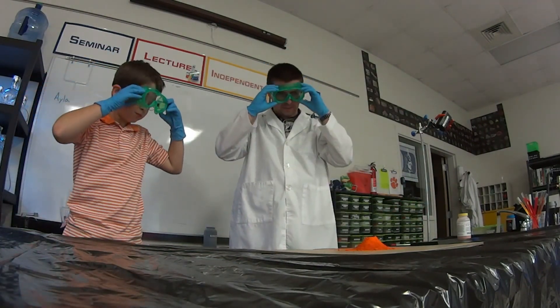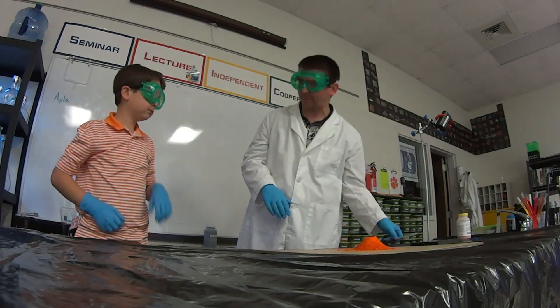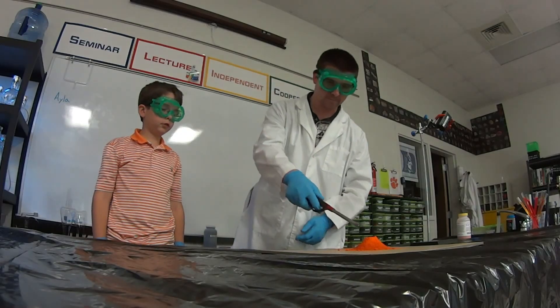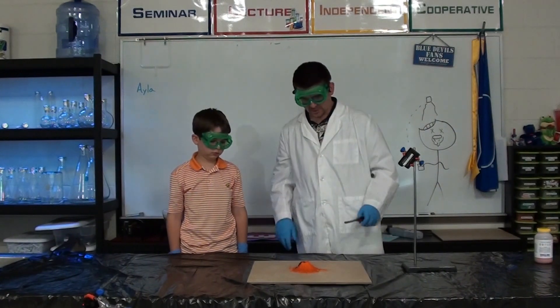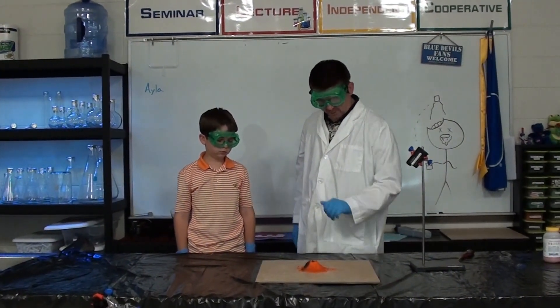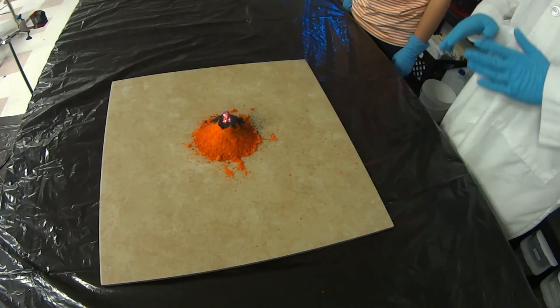We're going to light our pile of ammonium dichromate here. It doesn't have to run as soon as it lights, but once the ash starts coming up, we'll just kind of move away to the other side of the room until it's finished. Okay, now I think we're okay. We've got it burning here and you can see a little bit of ash starting to come up. As it gets worse, we'll kind of step away from it and just let it burn.